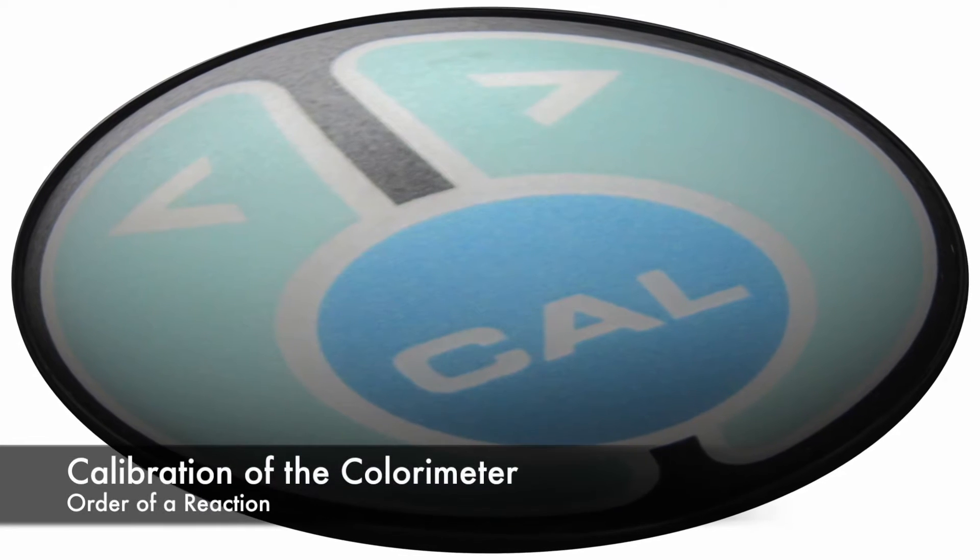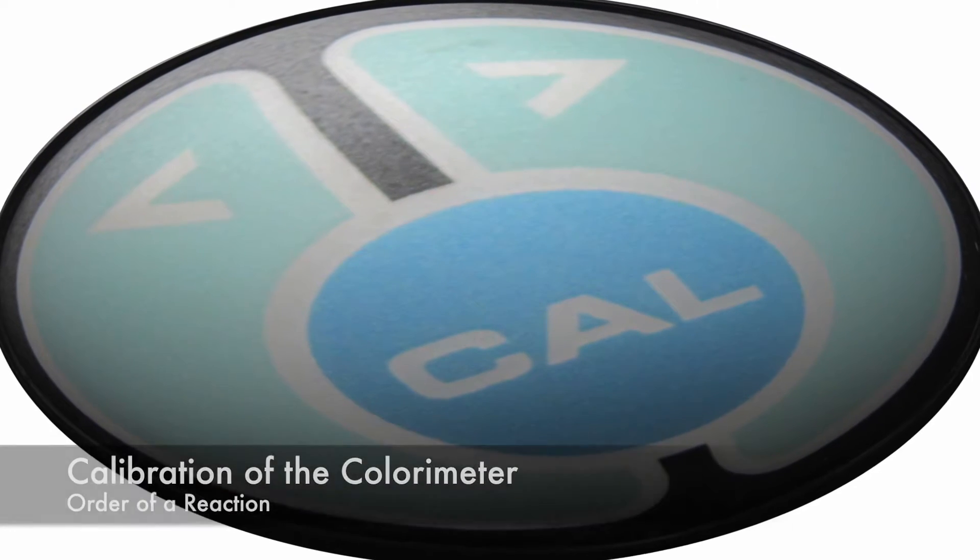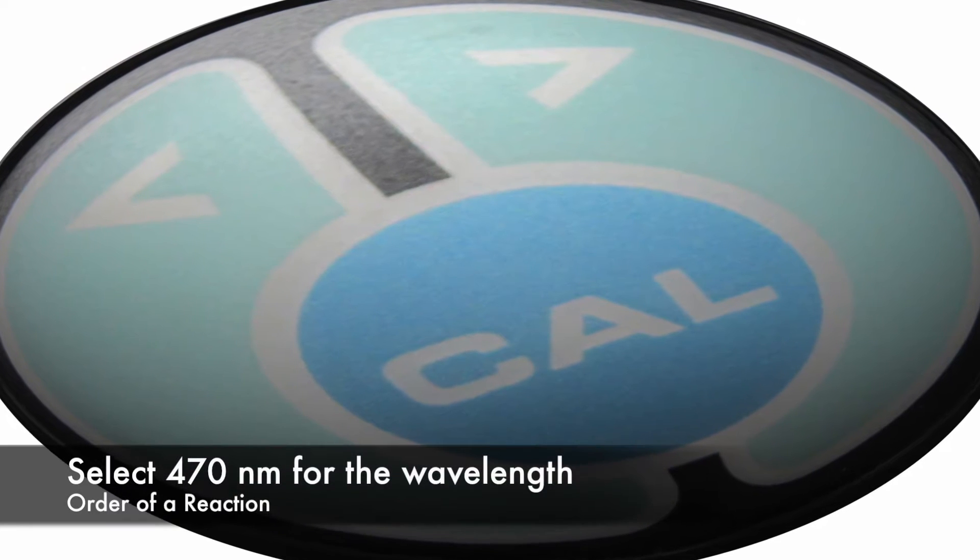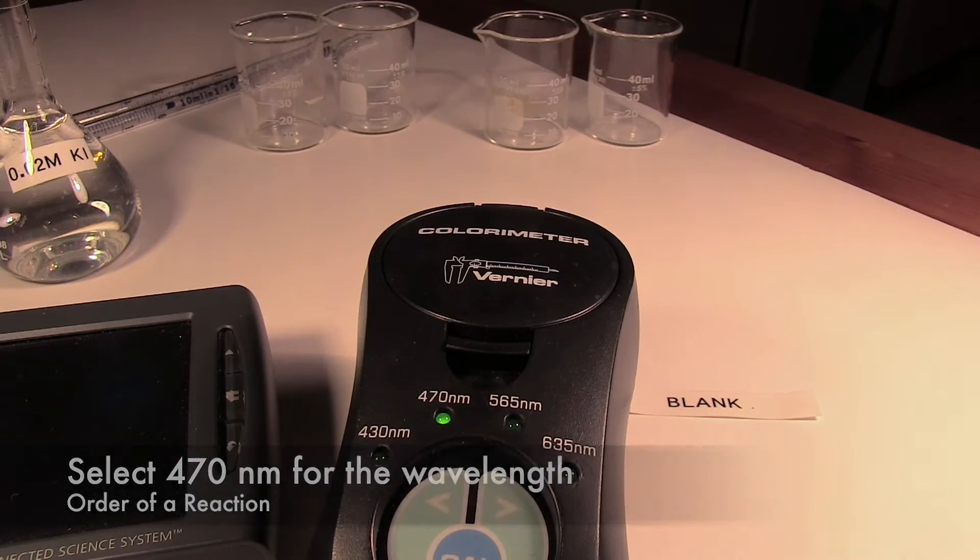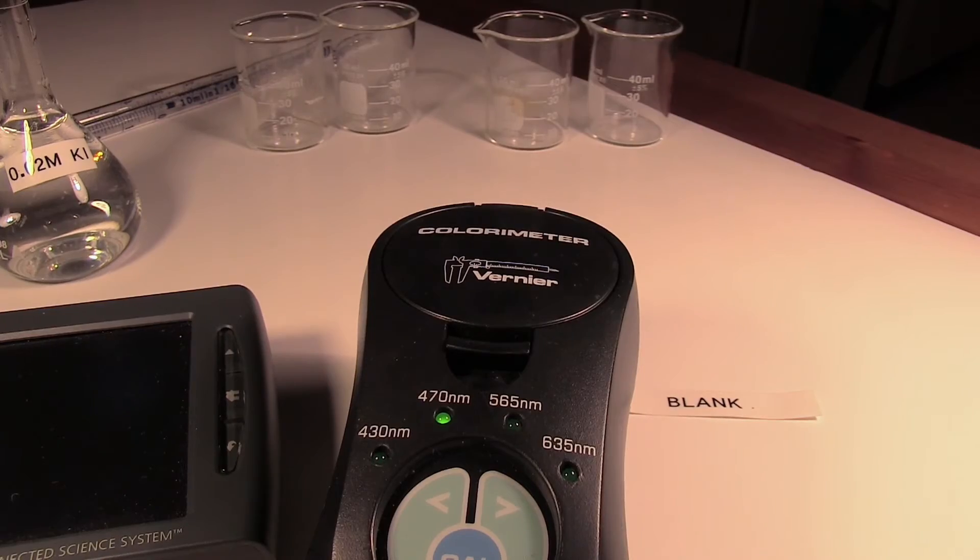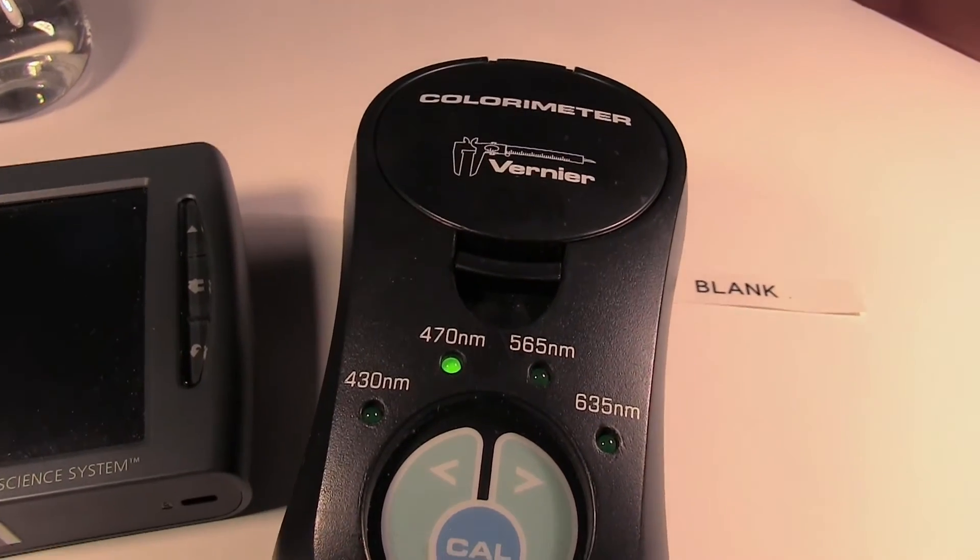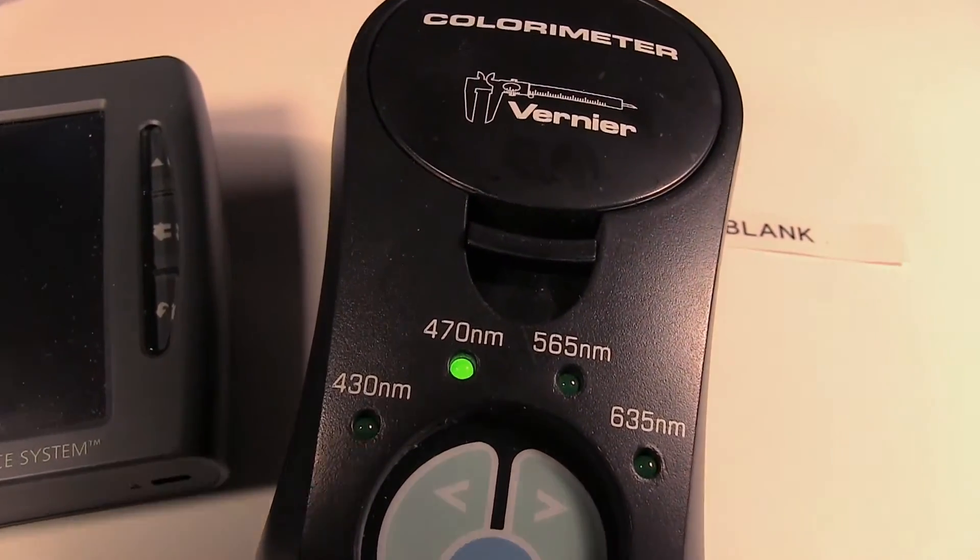First we will calibrate the colorimeter. Select the wavelength, in this case it is 470 nanometers. If not already selected, use the left and right arrows to select the correct wavelength.